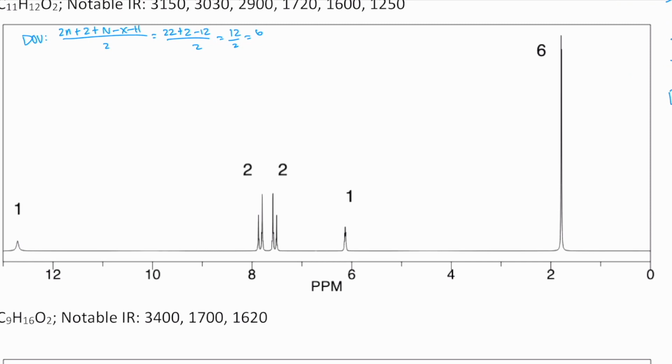My first thought is, hey, maybe we have a benzene here. Benzene NMR, H NMR is going to be a little bit further down the line, but I thought this was straightforward enough that we could do this one.